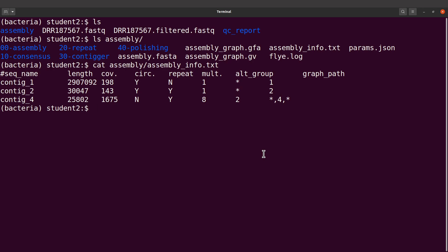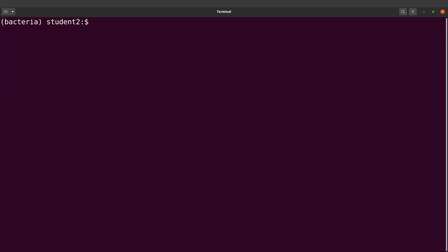So let's get back to the terminal. We're going to call Bandage. Let's clear the screen and then do an ls into the assembly directory again.